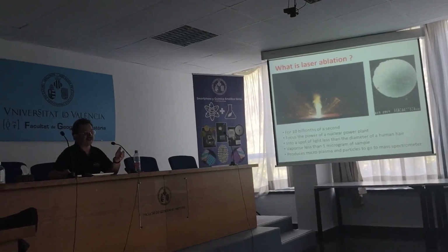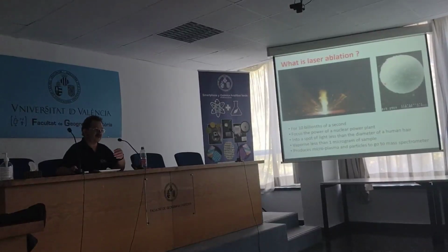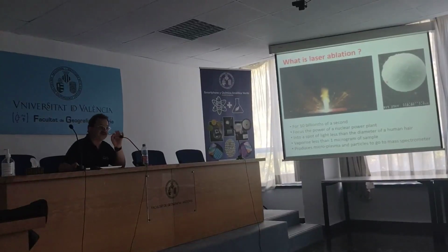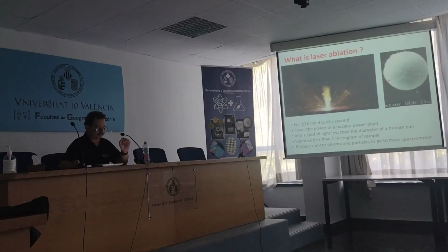And for the archaeologists, this is the important bit, because particularly archaeologists from museums will say, are you going to damage my sample? If you do the laser ablation right, they will need a microscope to see the sample you have taken, the 1 microgram.